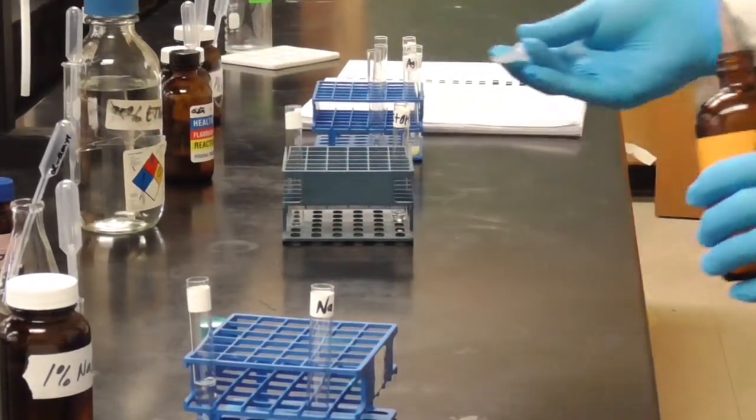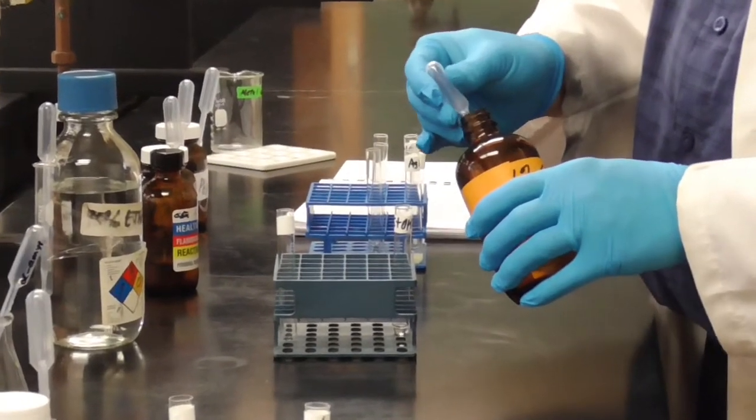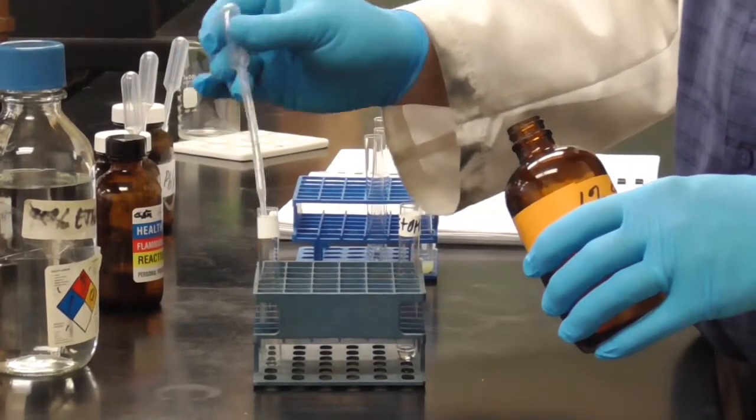That looks a little better. The other one looked a little low. I probably had some air pockets in there. Didn't get what I was hoping for.